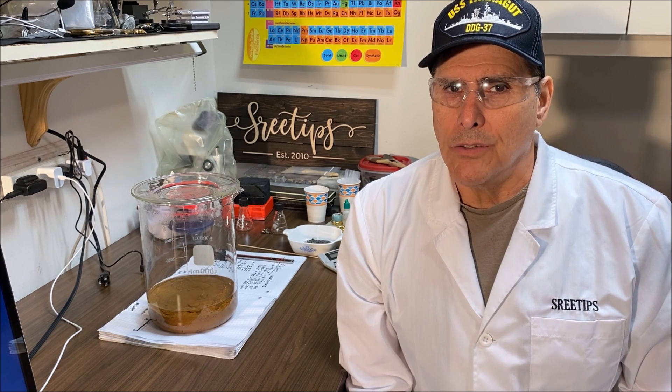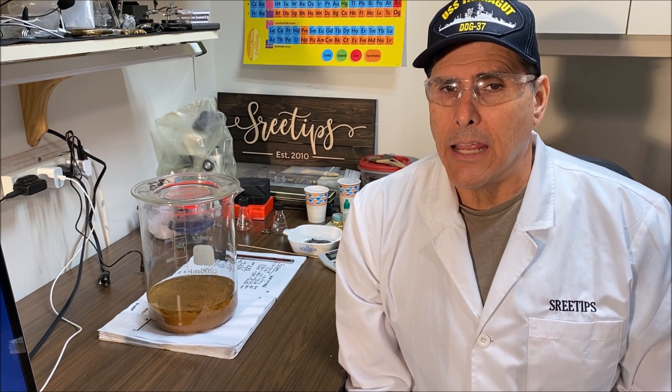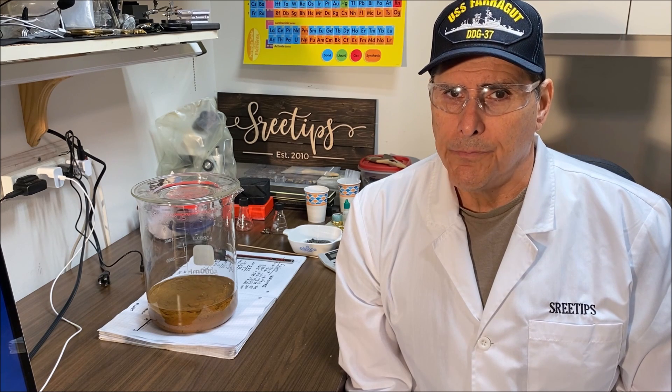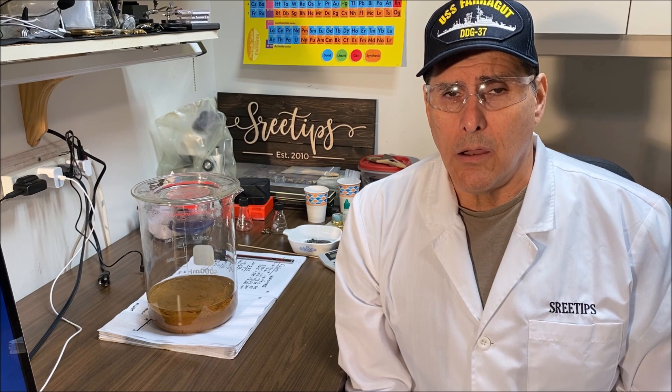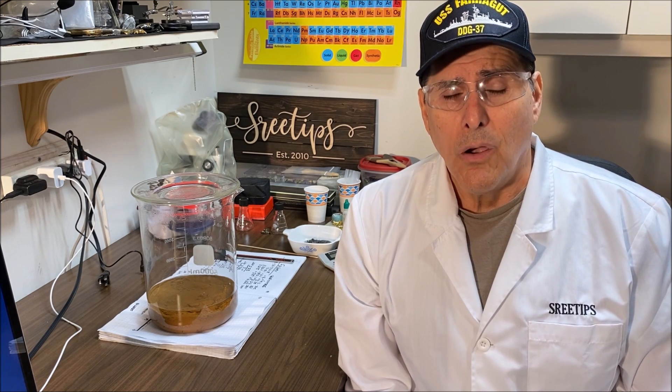I'll be doing reactions that produce deadly fumes and handling corrosive acids in this video. Doing these reactions without proper safety equipment could cause serious injury or death.